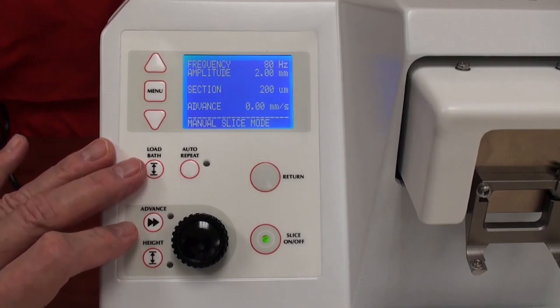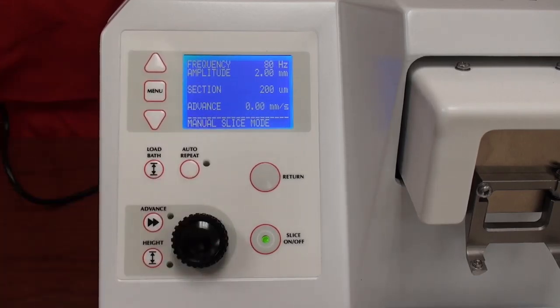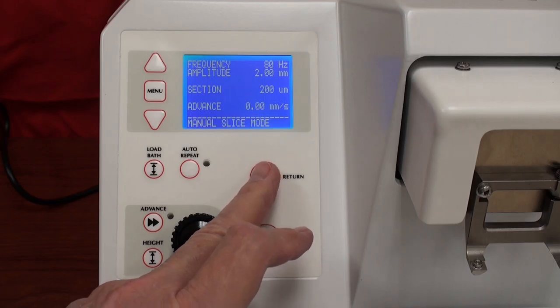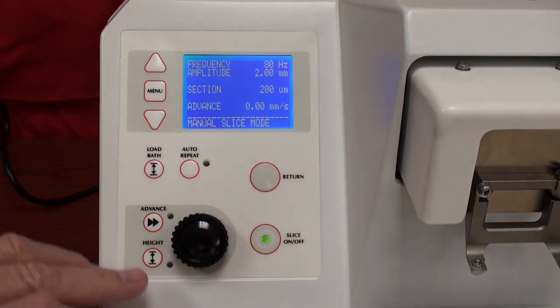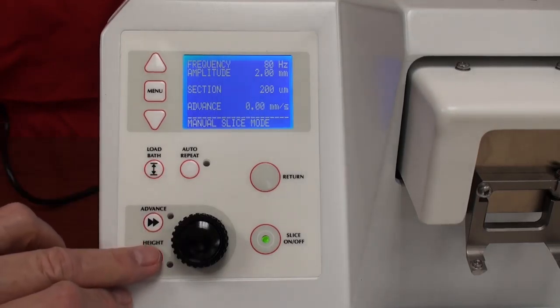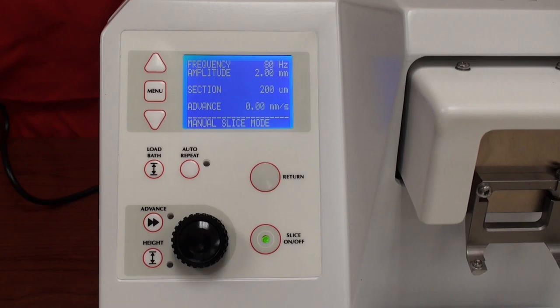On the front panel we have a number of buttons. Load bath raises and lowers the stage to the load or unload position. Auto-repeat we'll get to later. The slice button allows you to cut sections, either fully manually or semi-automatically — you press start and when it reaches the end of the cutting window, you press return. Advance allows you to set a cutting window, and height changes the height of the stage.